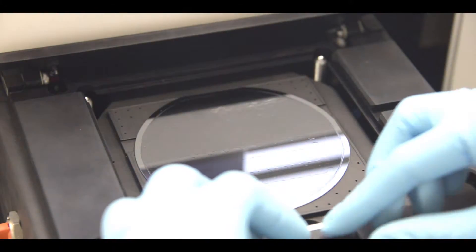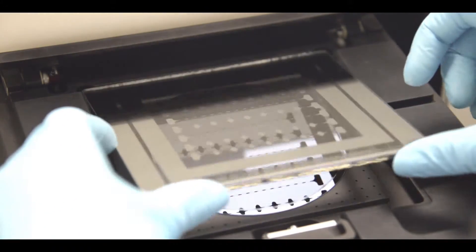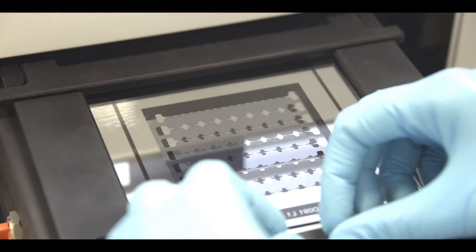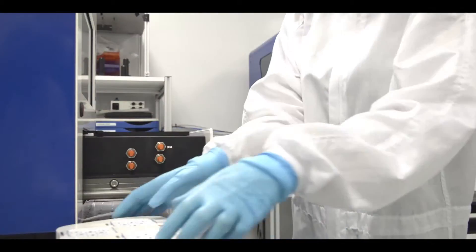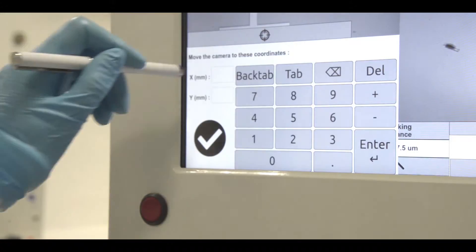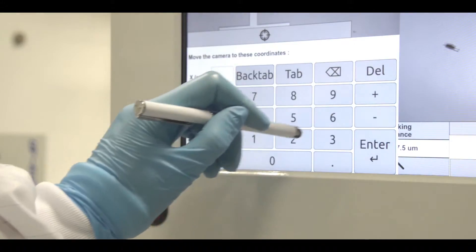The procedure is straightforward: the user places their wafer and then their mask. A pre-alignment is possible with the drawer open. After closing the tray, you have the ability to either search your alignment marks with the pad or enter their details directly and the aligners go there automatically.